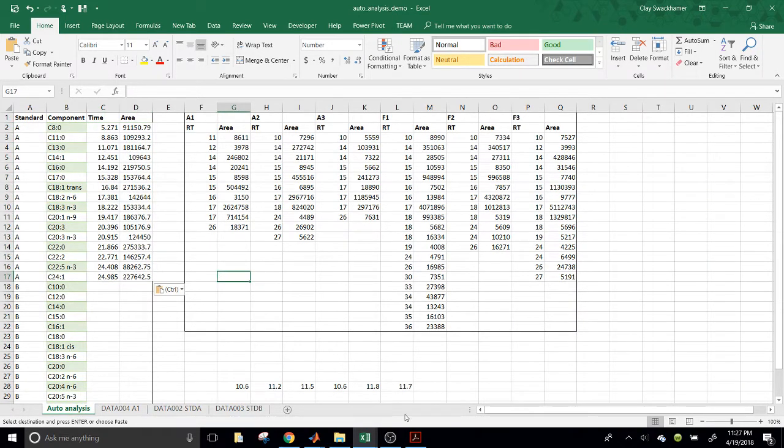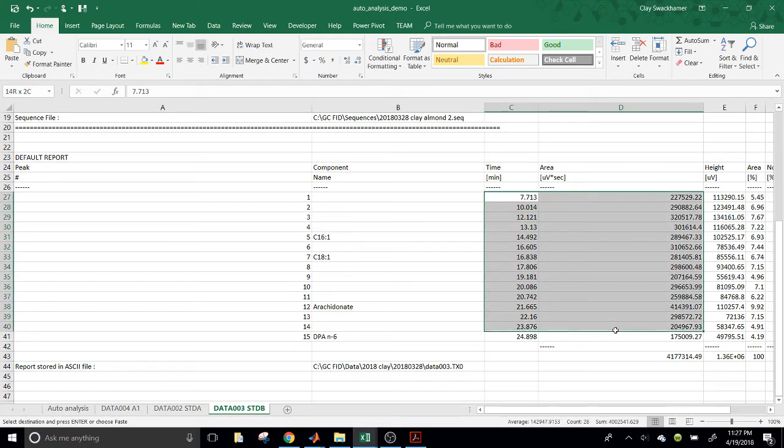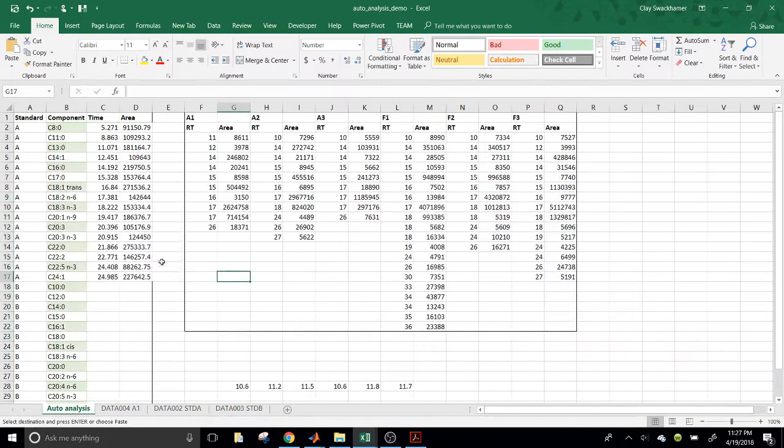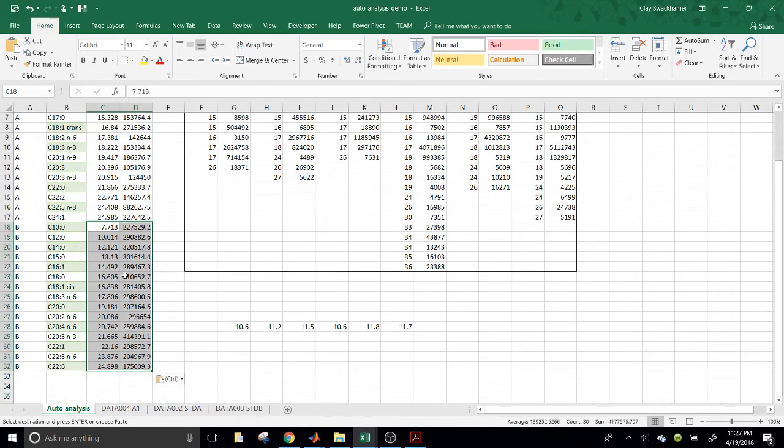Next, we may have, let's see, so we'll grab the one for standard B, too. Let's see if I get those times and areas, and they should fit right here.